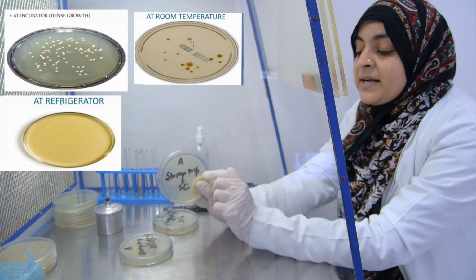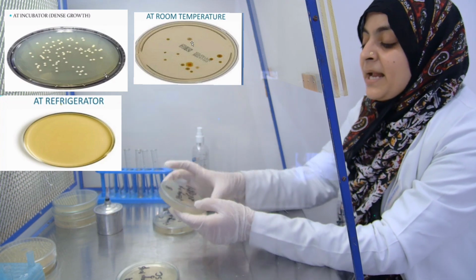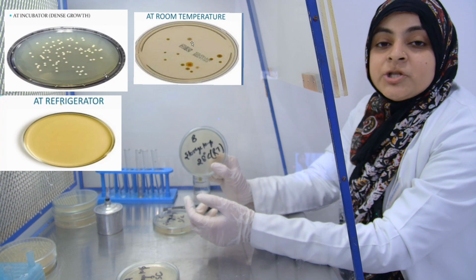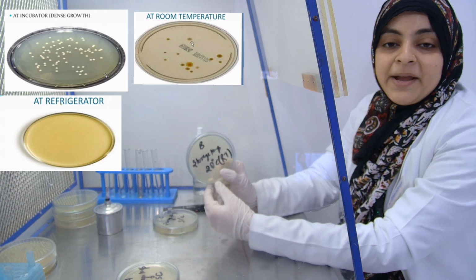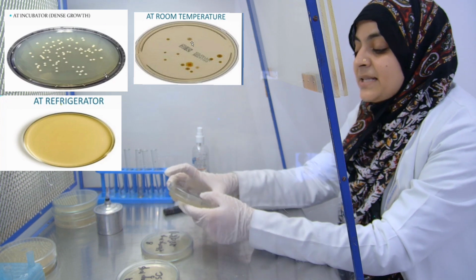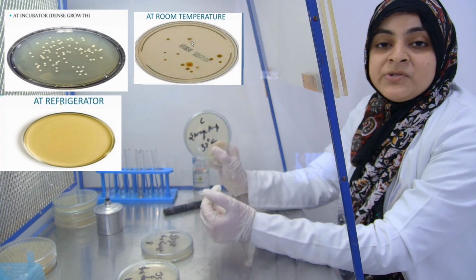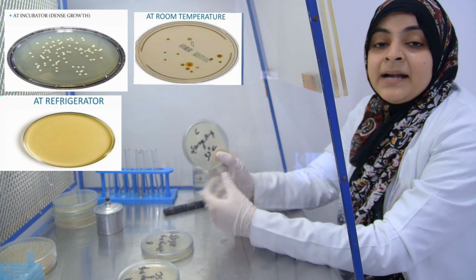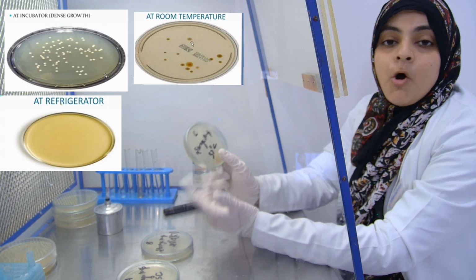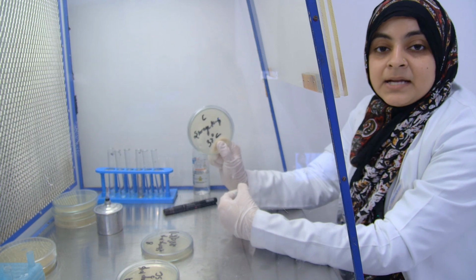That's why it does not show any growth. Now at 28 degrees Celsius, that is our room temperature, we observe slight growth of microorganisms, but at 37 degrees Celsius, there is maximum growth that we observe, which concludes that bacteria grow at an optimum temperature, and most of the bacteria can grow at this temperature.